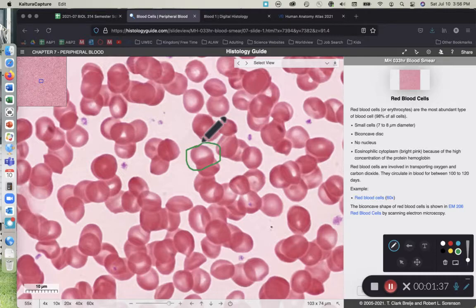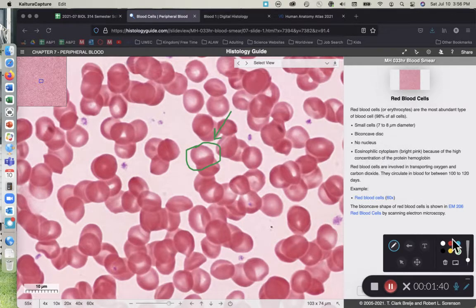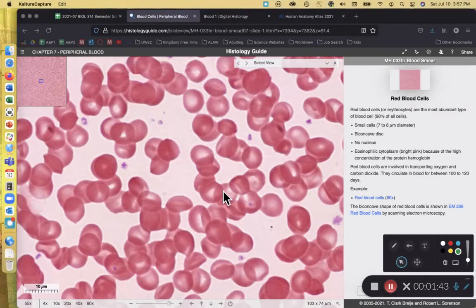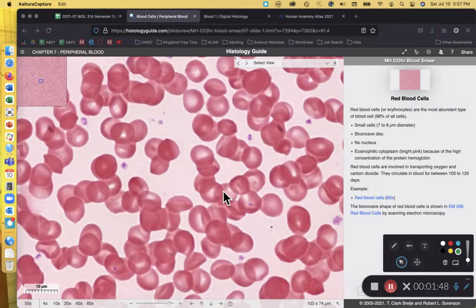This is an erythrocyte right there. As we look at these erythrocytes, they're going to be our measuring stick — our frame of reference as we look at the leukocytes and the thrombocytes. So that was the erythrocyte.